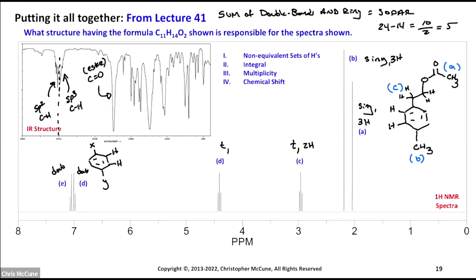It's next door to a CH2. And then we got D. D's the ester side of that carbonyl. And so those roughly are around 4, but it's also getting close to the aromatic ring. So it's around 4.5 or so, right? So it's a little bit of an additive effect here. And so I'm going to assign this as D. And that's a triplet 2-hydrogen.